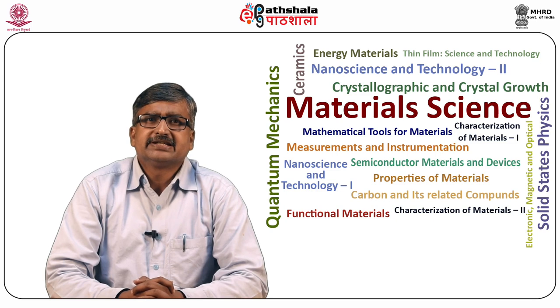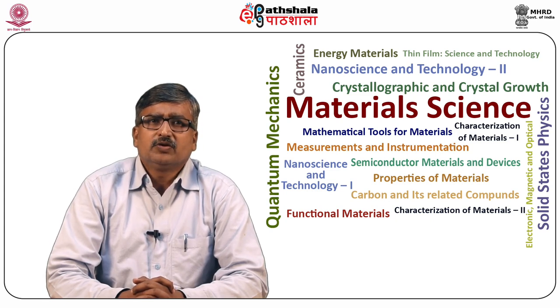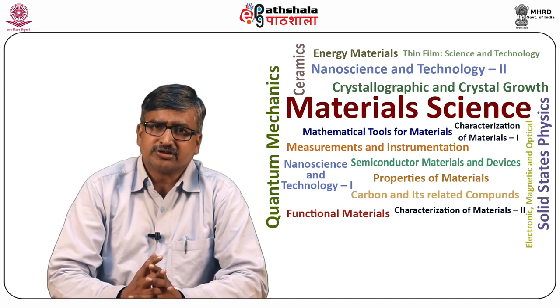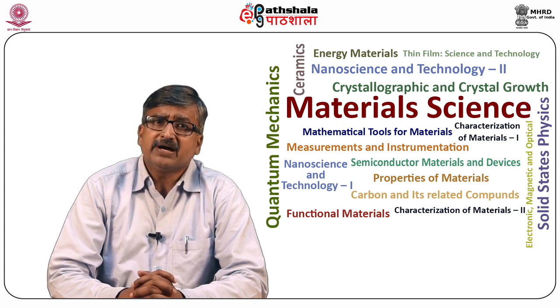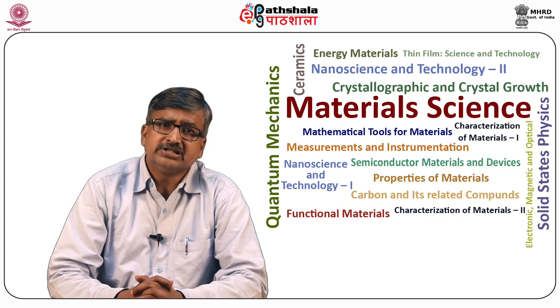Now I want to discuss the applications of TEM. As I discussed, this is a multitasking machine, so the transmission electron microscope is used to examine the structure, composition and properties of a specimen in submicron detail. Aside from using it to study general biological and medical materials, the transmission electron microscope has a significant impact on fields such as material science, geology, environmental science, among others.